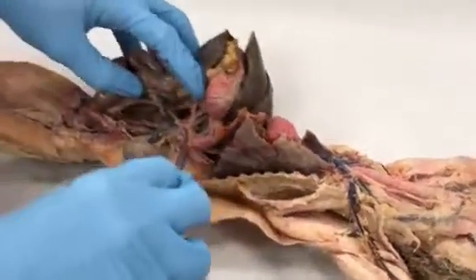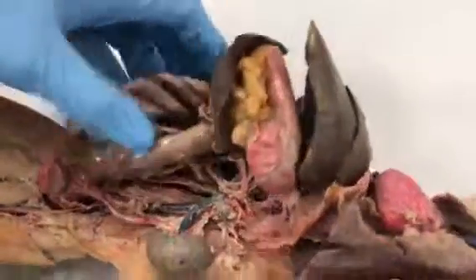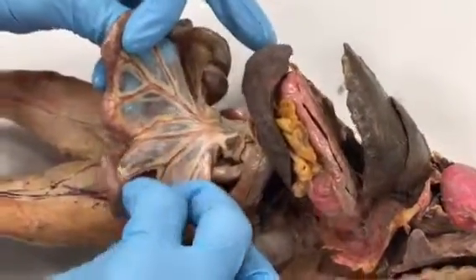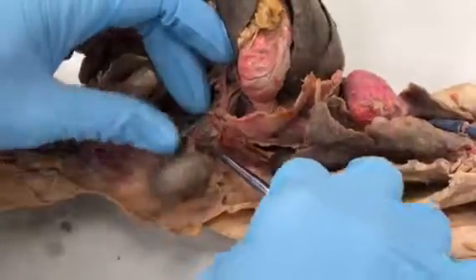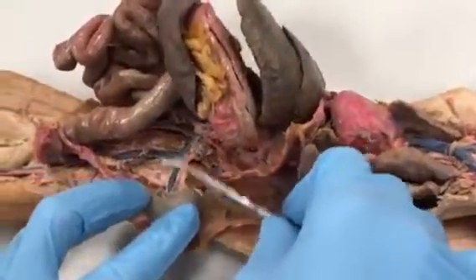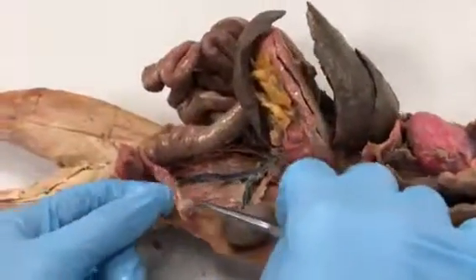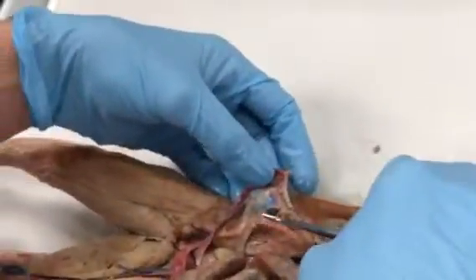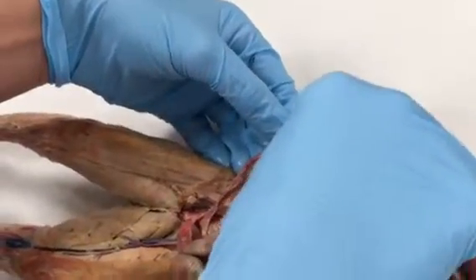And then, we can continue on this cat if you want to, you have the anterior mesenteric artery, and that is going to the mesenteries, this clear sheet within the small intestine. Then the next one that's on our sheet is the renal artery. We have the left and right renal arteries, depending on whether you're on the left or right side. This is the left renal artery. And then we will find the left gonadal artery, or in this case the right one, because the left one is cut there. This is the right gonadal artery, and since this is a female cat, it's going out straight across to the ovary here.